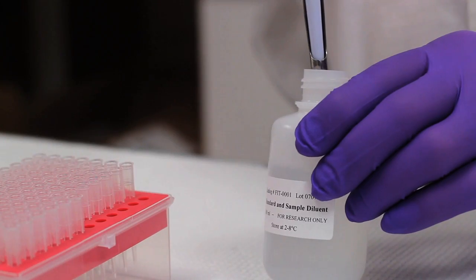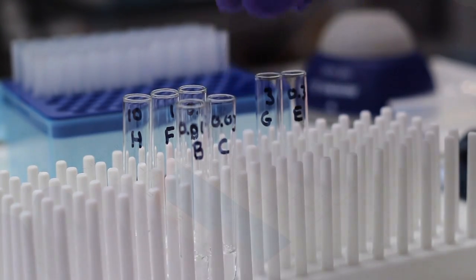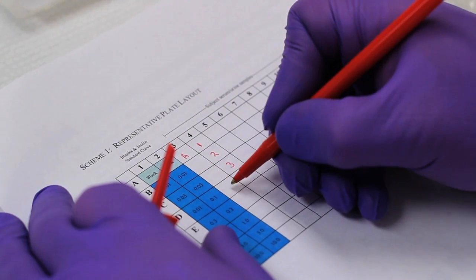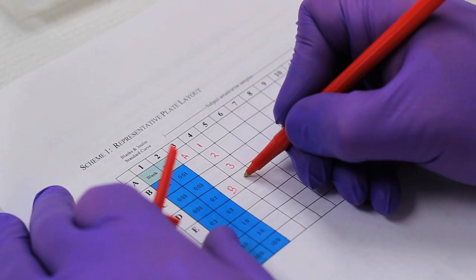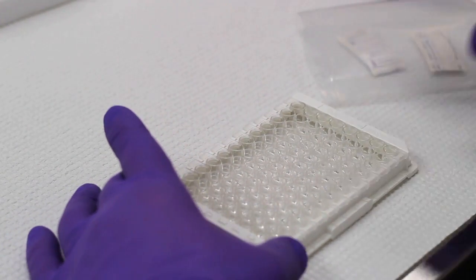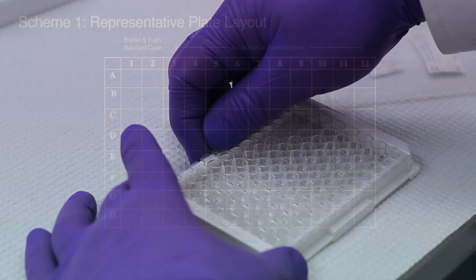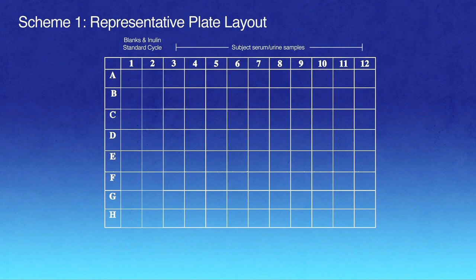Now that samples have been diluted and standards prepared, you are ready to start the ELISA procedure. Draw out the design of your plate using the schematic provided on the third page of the worksheet. After organizing, remove the plate from the plastic envelope and make sure the removable rows are firmly in place. Based on the schematic diagram, pipette 50 microliters of standard diluent into wells A1 and A2 to serve as blanks.